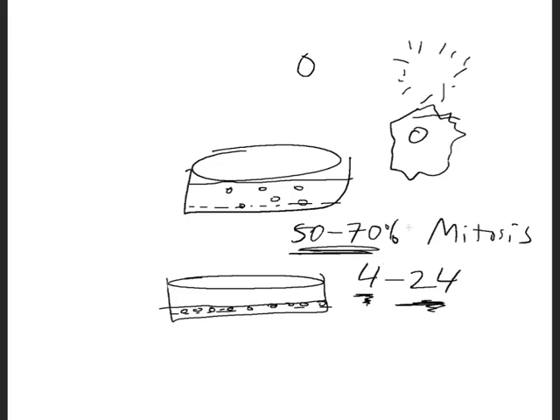You'd come in Wednesday and basically do the transfection protocol, which was to put the plasmid in the media, let it sit for a little bit, put the turbofectin in there, let it sit a little bit, let them combine, and then take that and add it to your cells. You first pull out all the media, and then you just add this small amount of media to your cells. Typically, we would do these in 96 well plates because with these really, really small wells, even though you have a little bit of media, they're not prone to drying out. And so that's why we like to do it in these little 96 well plates.